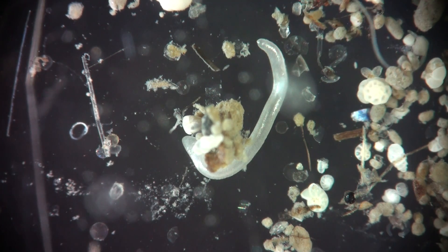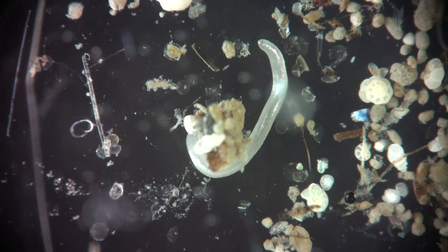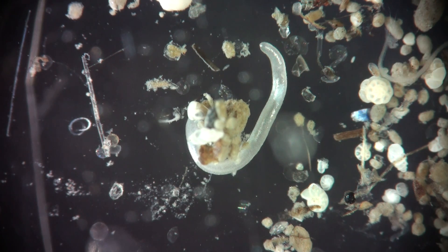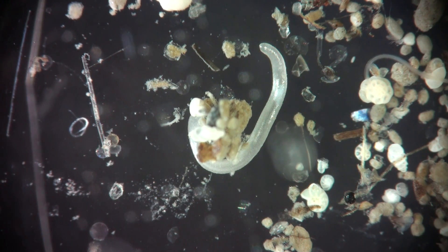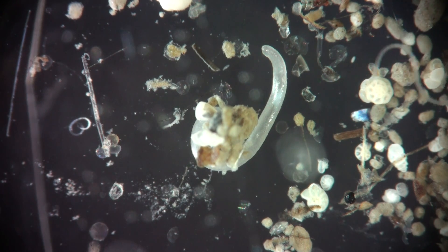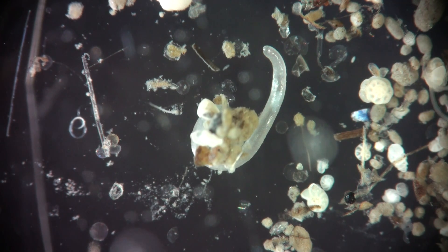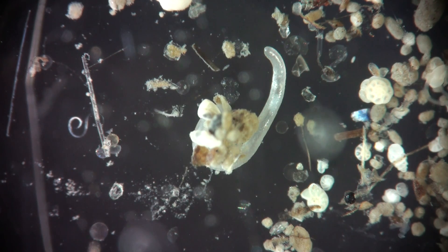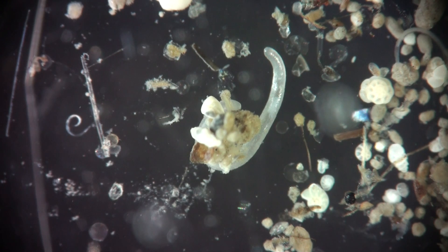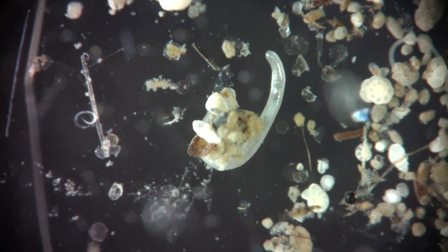So, what could it be? Could be anything else. And if we turn it over, we could see that pedal furrow where it has a very narrow foot. Now it's in the Petri dish, so we need to move it to a small place.